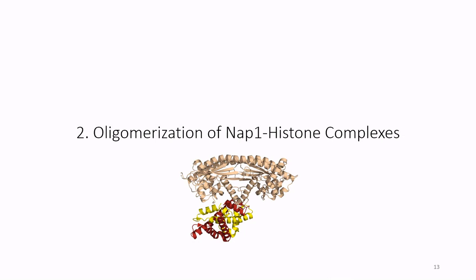We next investigated the oligomerization of the Nap1 histone complexes. Nap1, as you all know, is a histone chaperone and interacts with all the histones. So we wanted to characterize our new Nap ortholog, the worm Nap1, and compare it to yeast Nap1.